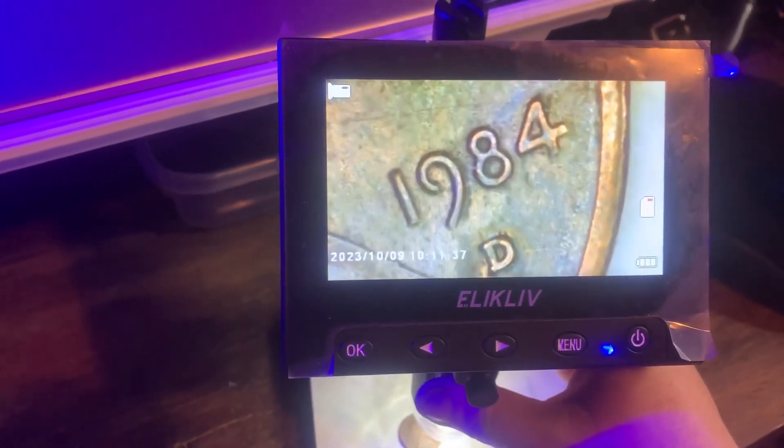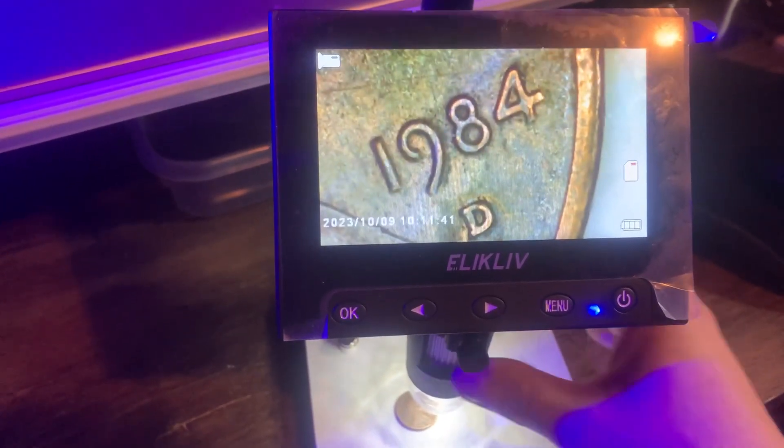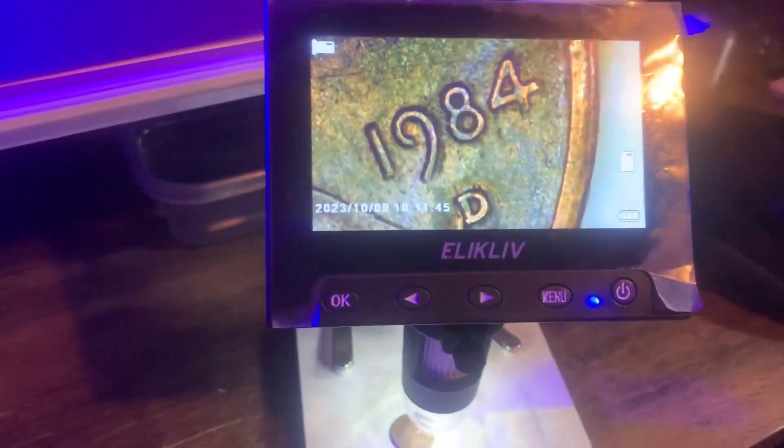Obviously you would need to adjust it. There we go. It has a little knob here so you can adjust it and make it more clear.